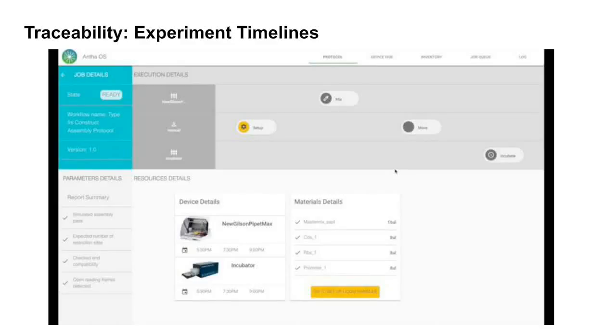The net result of all of that, though, is that you've got a robust log of everything that's been conducted in this experiment, including the physical objects, all the information flow, what specific working practice was performed at every one of these stages, and ultimately a robust provenance of what was done to produce every piece of information in your experimental results. That rich data log is then something that you can readily interpret using much more complex tools. Again, the easiest way is to show you that.